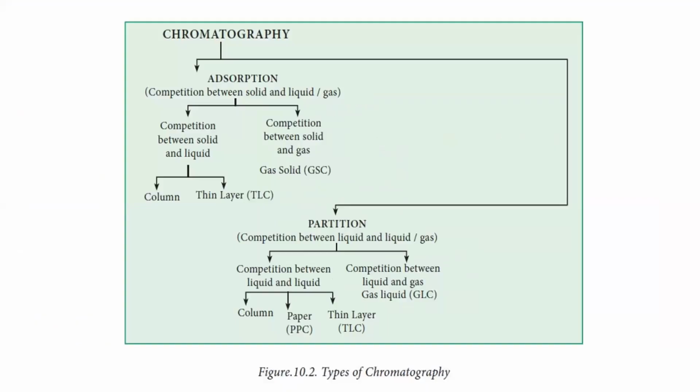Okay, so we saw what is partition chromatography. We saw that it is basically the mobile phase also changes there. So liquid chromatography, gas liquid chromatography, based on the partition coefficients of your analyte, of your solute.